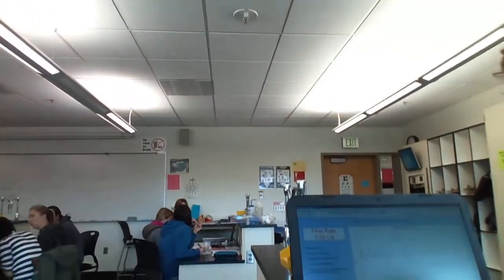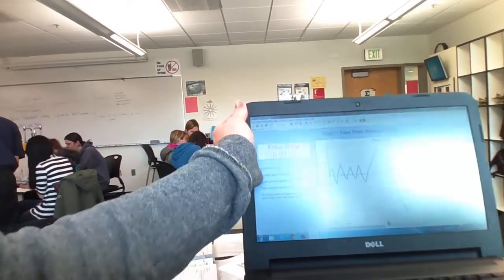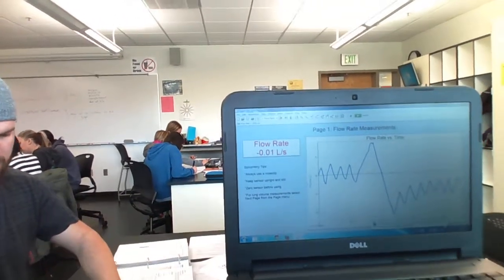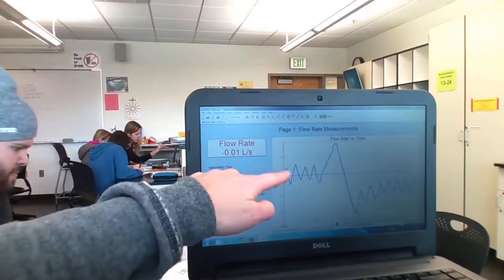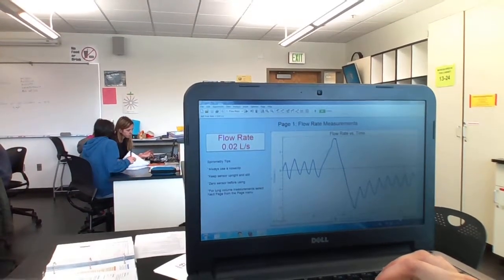So this is what we have. Okay, so what am I looking for? Move the cursor to the peak and note the volume value. So the Y value is... Move the cursor to the first peak: 0.386.